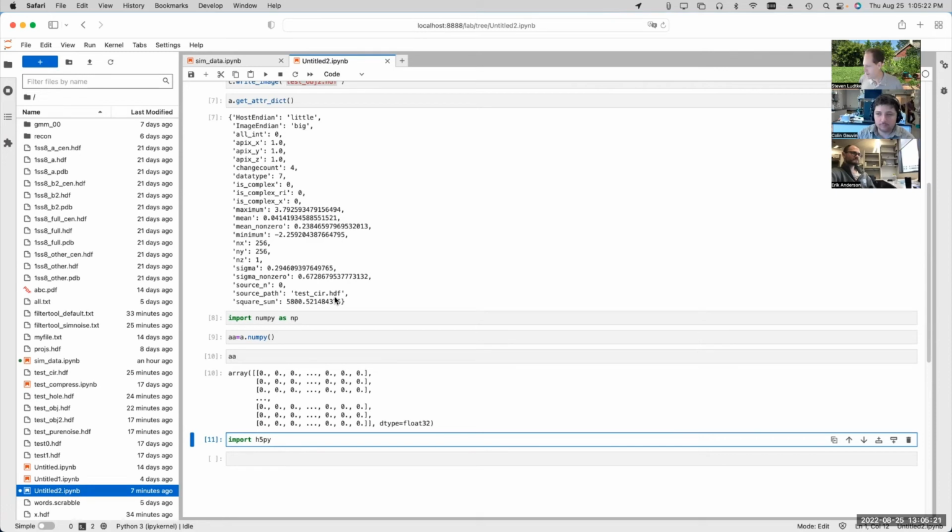And there have been all sorts of things that people have done which have just been horrible. So MRC files, while they are a standard, and while there's a paper which describes the standard, real MRC files in the community are all over the place. And I don't know how good that standard MRC reading library actually is in terms of being able to handle every possible variant. Yeah, that's something I've struggled with, especially getting older software to read newer MRC files.